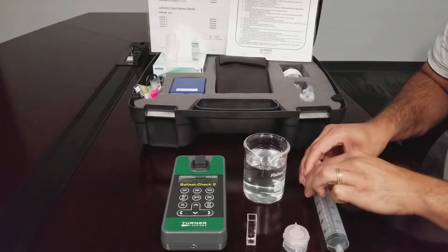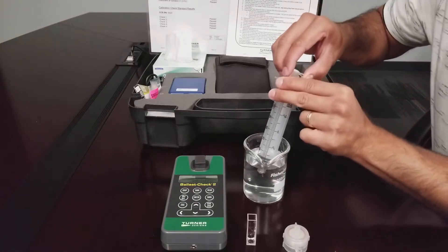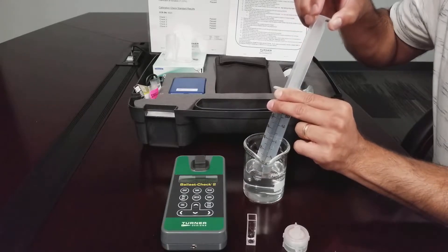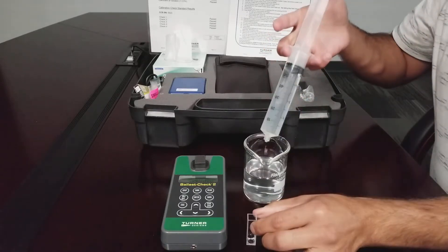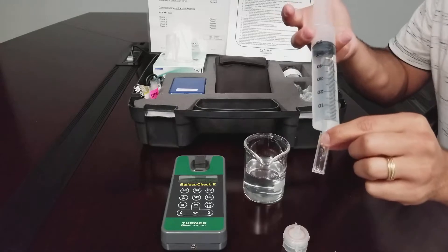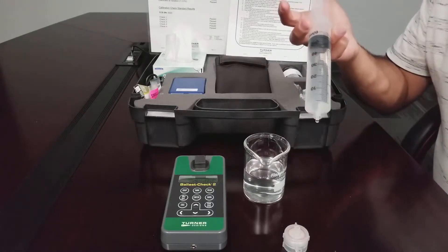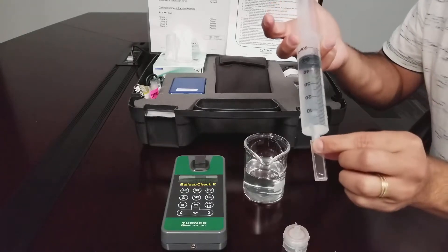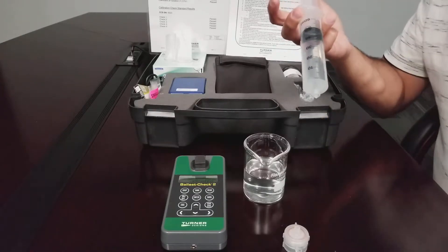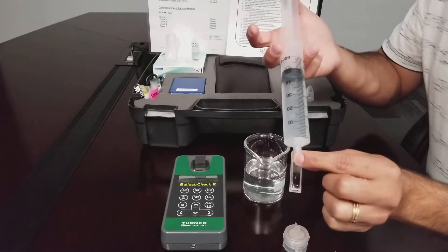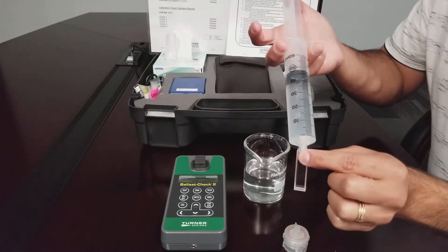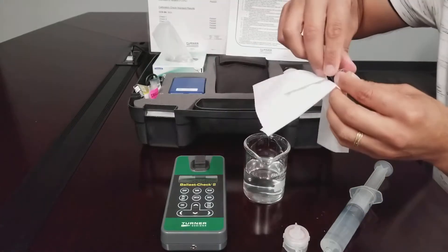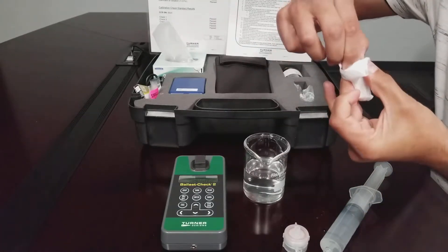Use the syringe to sample 60 cc of ballast water. Rinse the glass cuvette 3 times using your sample and fill the cuvette 3 quarters full. Use a kim wipe to wipe the sides of the cuvette to wipe away any moisture and fingerprints.